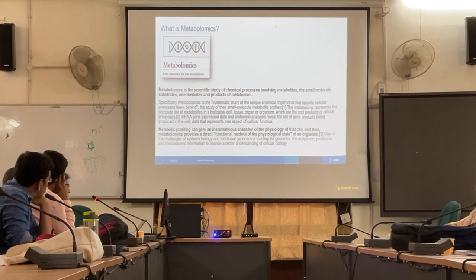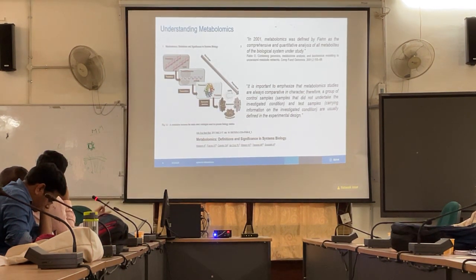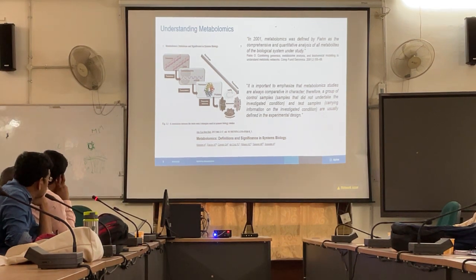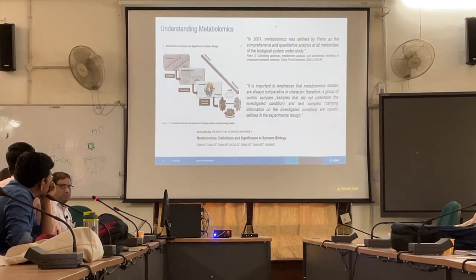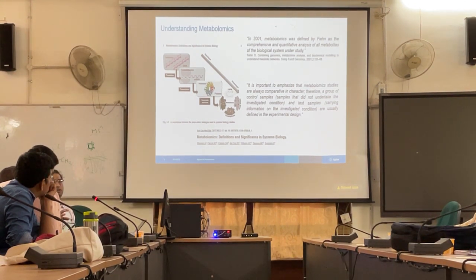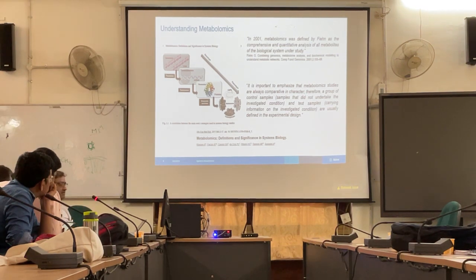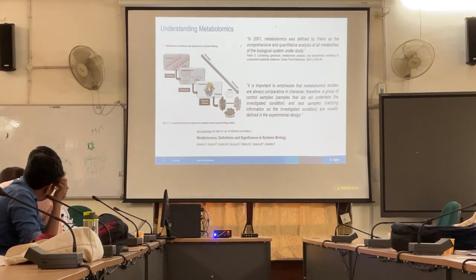The only thing is, compared to genomics, in genomics you have PCR where you can amplify, but in proteomics and metabolomics you don't have PCR. So that is the reason we use mass spectrometry. Mass spectrometry is a high sensitivity readout, highly reproducible, and that is why people use it for metabolomics. Okay, so please feel free to stop me because we are going to spend a long time. It is good to have discussion rather than looking at the data alone.